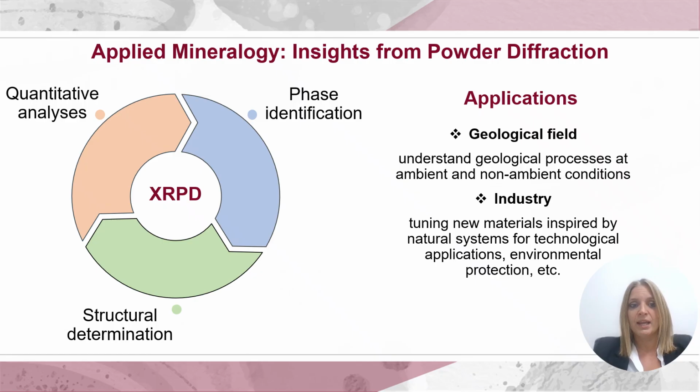In the geological field, X-ray powder diffraction helps to understand processes from formation to change, but also in industry it helps us design and tune materials for technological and environmental applications. So in short, X-ray powder diffraction turns complex mineral systems into actionable knowledge.